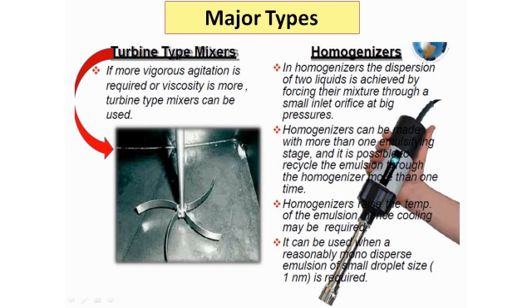Whenever we do homogenization using this type of homogenizer, we always need to do cooling simultaneously, because this homogenizer rotates at a very high speed, suppose 22,000 RPM. Just imagine 22,000 revolutions per minute. When a homogenizer moves at such a high speed, definitely it will create some heat. So if we are going to prepare some emulsion, then we need to cool down the temperature during use.